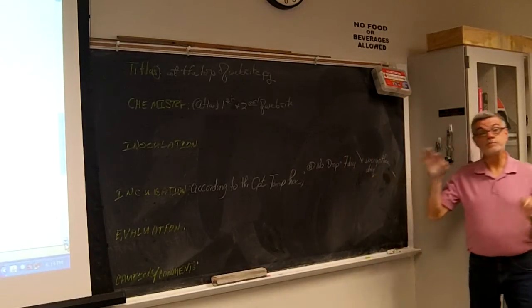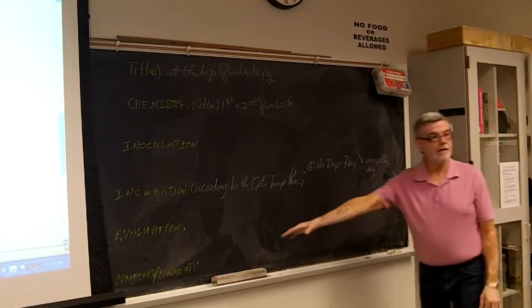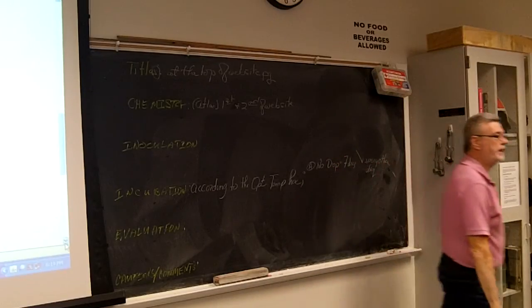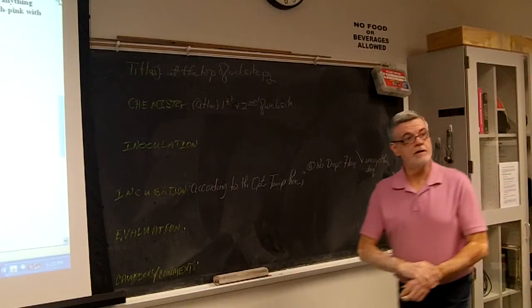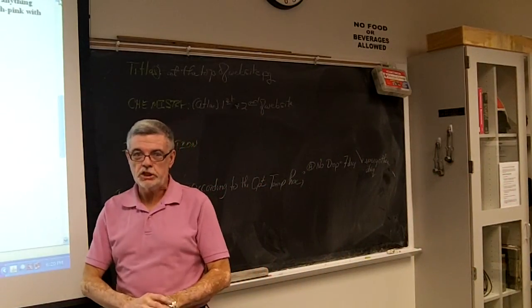Now, just for this particular experiment, not for the other ones, remember, cautions and comments. Sometimes there's an exception. How do I know? You read. If you read this, you'll learn. Has anybody ever been to one of those meetings where they say, "Hi, my name is Donald Hicks and I'm an alcoholic"? Well, guess what? Tubes can be too. Bacteria can be alcoholics. That's where we get ethanol, which is vodka, which is good.